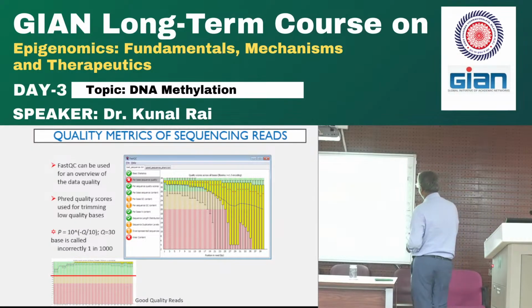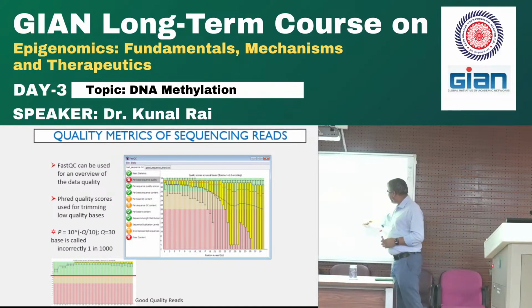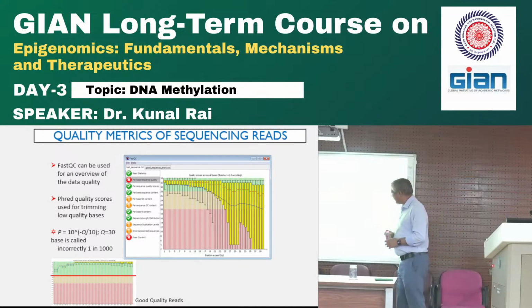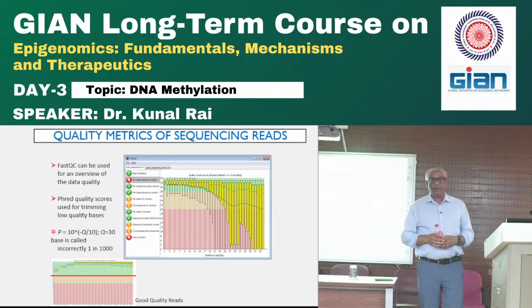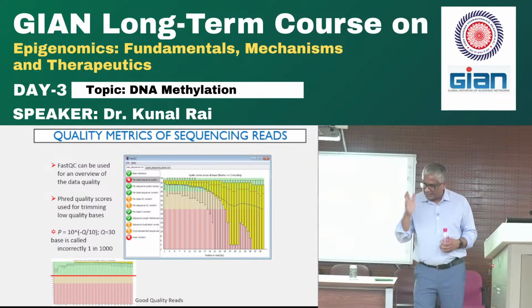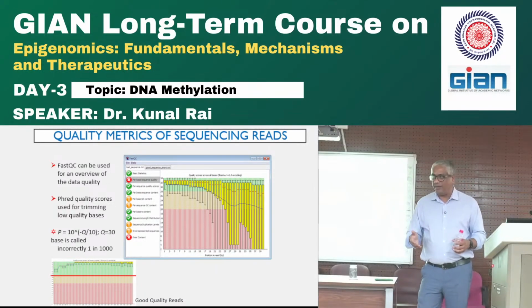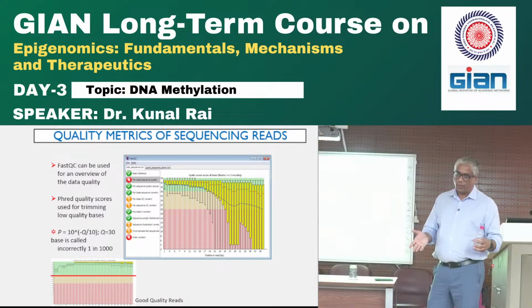You see all these are called box plots. You see the box plots going all the way, right? Like this. So all of this sequencing was not good. Has anybody done any kind of Sanger sequencing in your life? No? Okay. Then you guys won't understand enough of this. But nonetheless, there's a confidence that where A is, there is only A. Sometimes your Sanger sequencing will give you N because it doesn't know whether it's A, T, G, or C. So that's a bad quality sequencing.